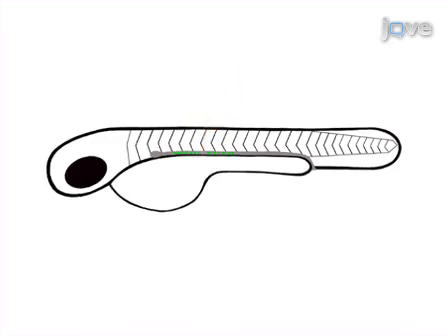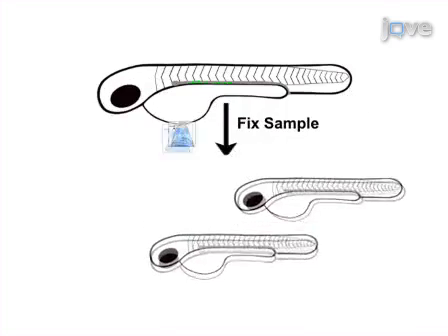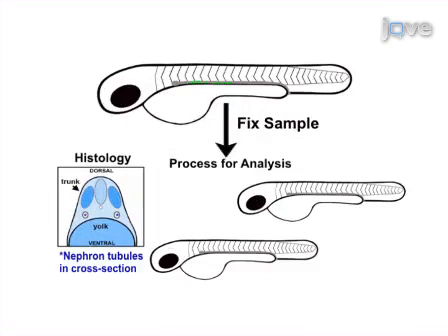Later, morphological and molecular changes are assessed using histology, whole mount in situ hybridization, and immunohistochemistry. The main advantage of this technique over existing methods, like acute kidney injury using the nephrotoxic antibiotic gentamicin, is that such treatments trigger catastrophic damage and are lethal, precluding the analysis of renal regeneration events over time.